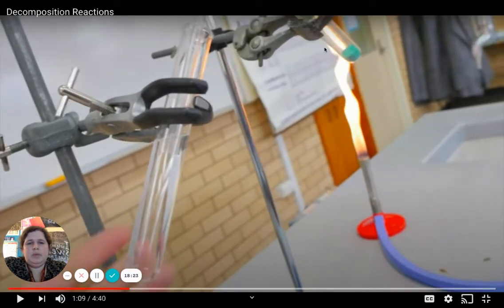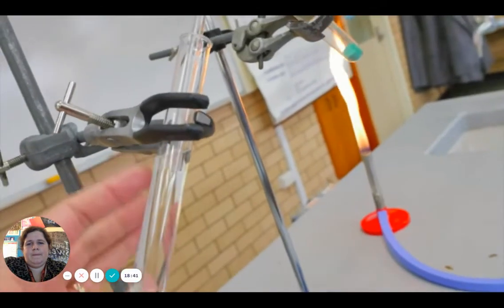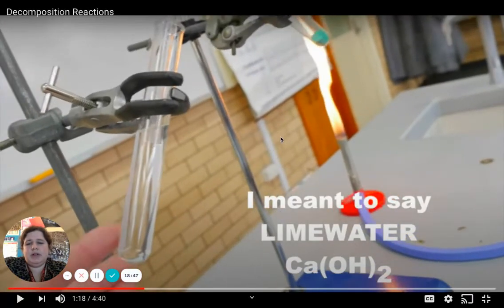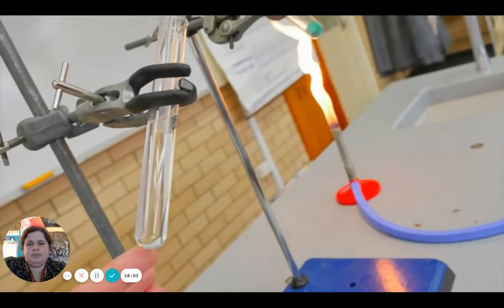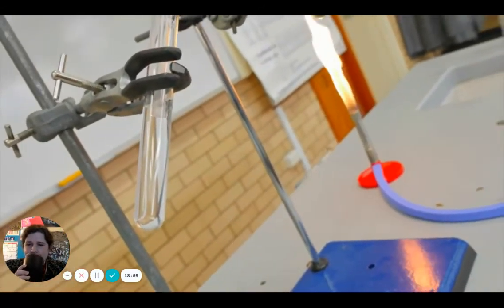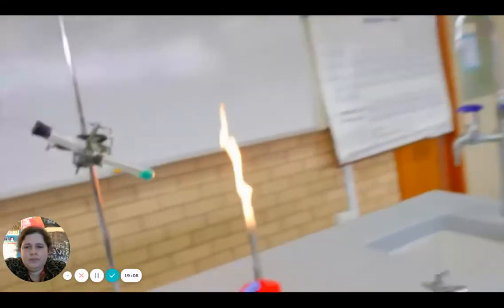So it's important that the copper carbonate test tube is sealed so that we can trap the gas and transport the gas through that, basically like a straw, into the other test tube, pumping it into some liquid, and if bubbles come out, that means that there's some sort of gas. To help tell the difference, I filled this one here not with water, but with lime water, or calcium hydroxide. Lime water reacts with carbon dioxide, and it makes it precipitate. So if we see this change into a cloudy color, we know it must be carbon dioxide. If not, it might just be the oxygen or something like that. So let's put it down here in the tripod and see what happens.